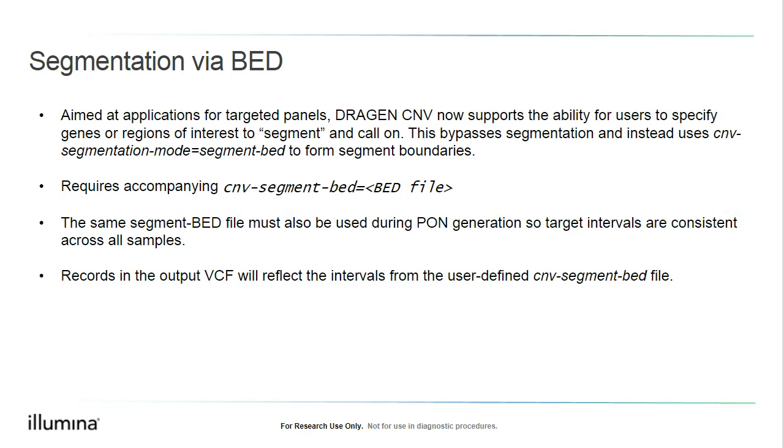And then when you're using this segmentation bed file, you would use the same bed file for PON generation, so the target intervals are consistent across all the samples, and then the records in the output VCF as part of the CNV analysis will reflect the intervals from those user-defined CNV segment bed files. So again, just some additional capability if you are interested in defining your own regions to segment and call upon.